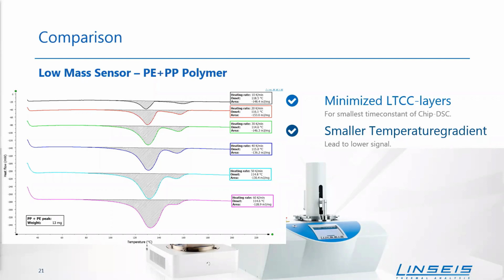So, why should I use such a high heating rate? This depends on your application. For example, if you're focusing on industry or something like this and want to compare different production properties, it could be important to use such high heating and cooling rates here. And so for this reason, it could be important to run it with 60 Kelvin per minute or even higher.